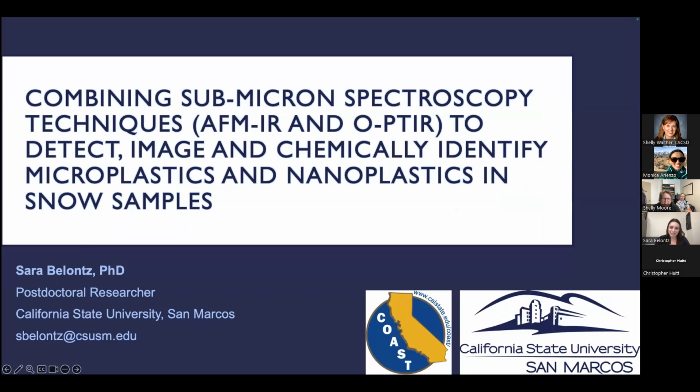Okay, happy Thursday, everybody. I thank you for that great introduction. I also would like to thank the organizing committee for having me here today. Today, I'm going to present a little bit about what I've been doing for, actually, it's quite recent, this project in the snow samples, very preliminary, but today I'm excited to talk about combining submicron spectroscopy techniques, AFMIR and OPTIR, to detect, image, and chemically identify microplastics and nanoplastics in snow samples.